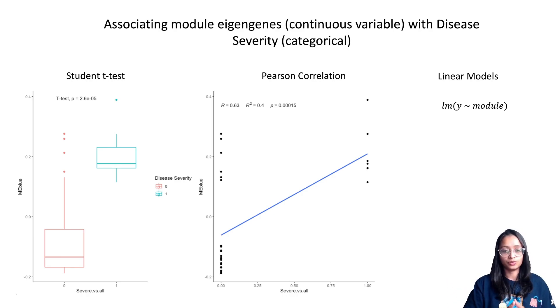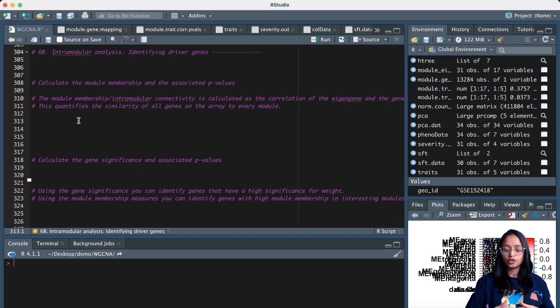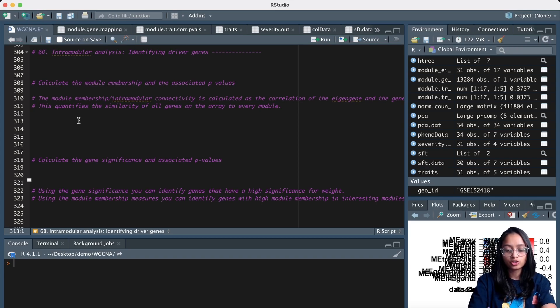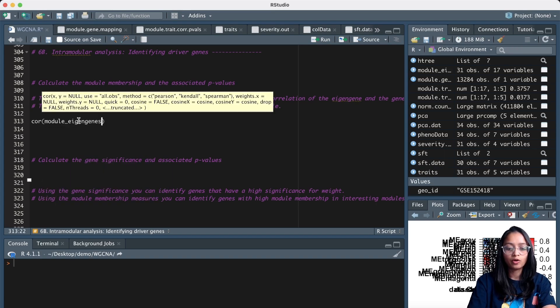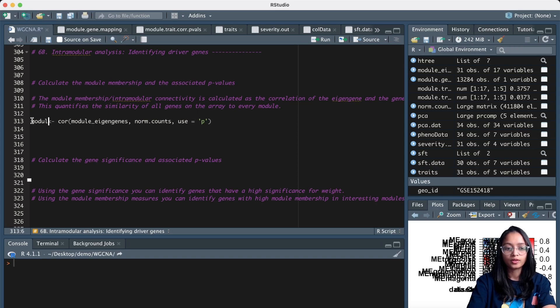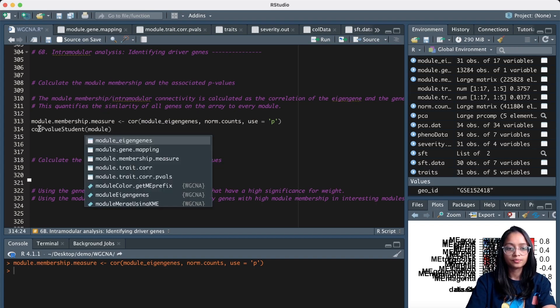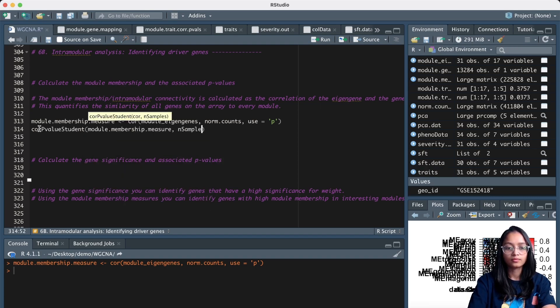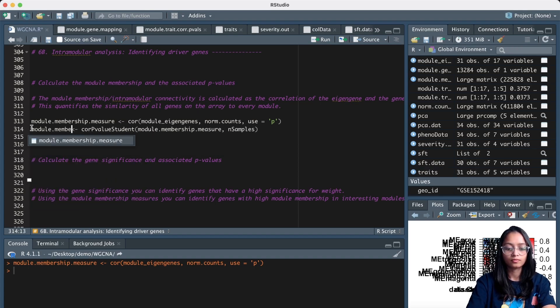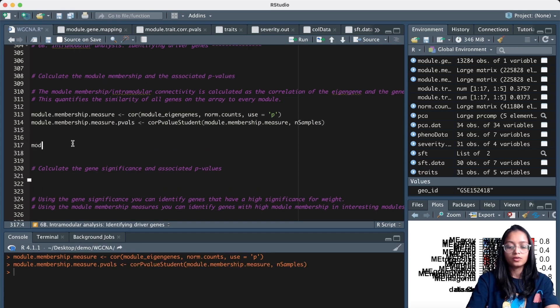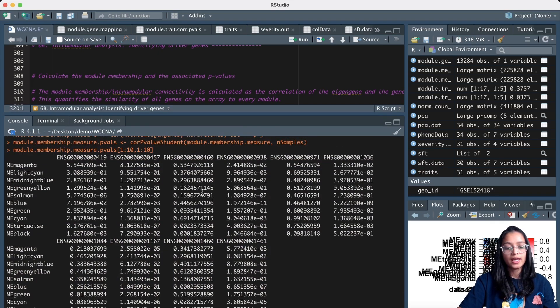We can identify highly connected intramodular hub genes by calculating the correlation of module eigengenes and the gene expression profile. Let us get the module membership measures by calculating this correlation — correlating module eigengenes with normalized counts using Pearson correlation — and assign it to module_membership_measures. Once we have module membership measures, we calculate p-values for these measures. Looking at the module membership measures and their p-values, we can identify which genes have high membership in the modules of interest.